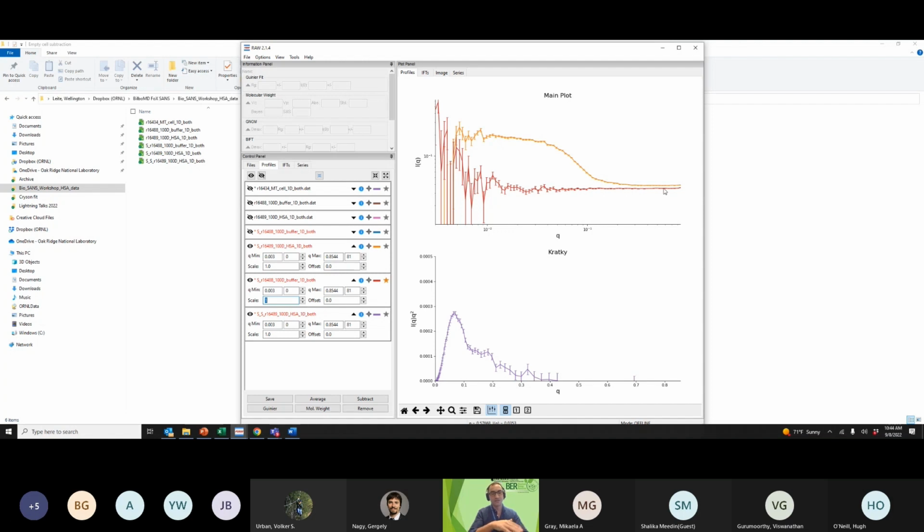So when you have those differences in the high Q, especially when you have D2O present in your sample, it can cause a mismatch there. If it's not huge, it can be corrected using the scaling factor like I'm using here. So you are just moving up the buffer background, increasing the incoherent scattering that is missing on that sample.